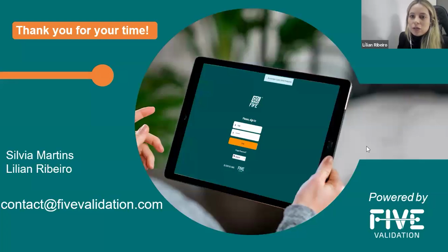Okay, thank you, Silvia. I'm afraid we can answer just one more question. So I selected here one from Mohammadi. Can I consider standalone HPLC software GAMP 5 category 4? What is the difference between CDS and standalone HPLC?